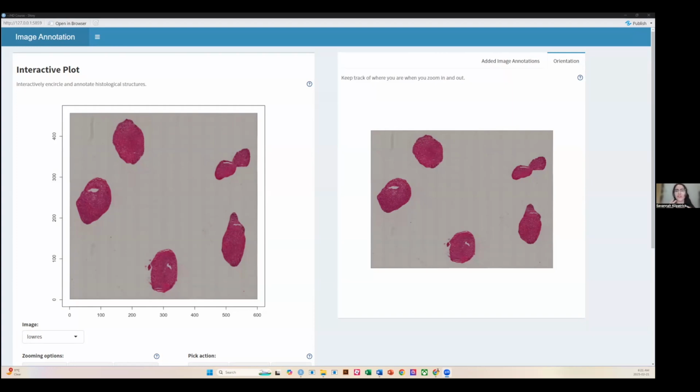It's a very user-friendly, interactive way of looking at gene lists for gene enrichment and gene ontology analysis. So this Shiny app was developed by the Mulder Lab. It's called SPATA2, and it's the general person that writes it. His name is Jan. He's very receptive to communication. I've talked to him a lot to try to get some of the dev working on this.